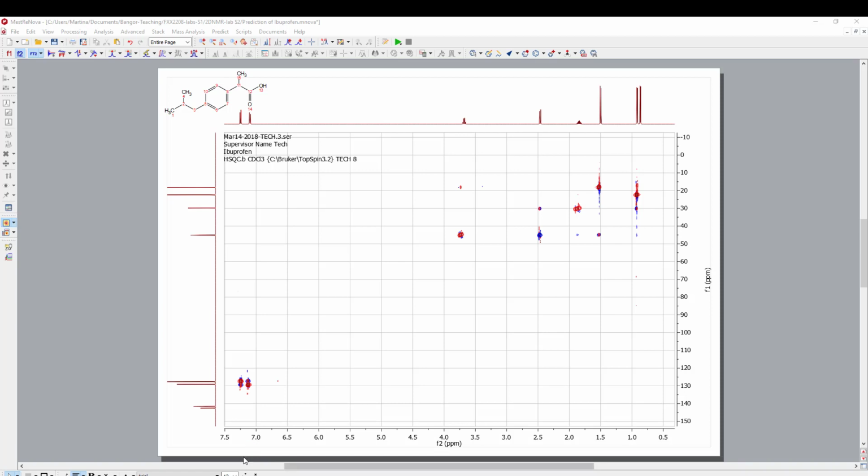So what we see in this type of NMR experiment is how carbon atoms are connected to hydrogen atoms through one single bond. You could use the same type of experiment also for other heteroatoms. So for example, carbon to nitrogen would work, or nitrogen to hydrogen, or whatsoever. The important bit is that we have a single bond connecting those two atoms.